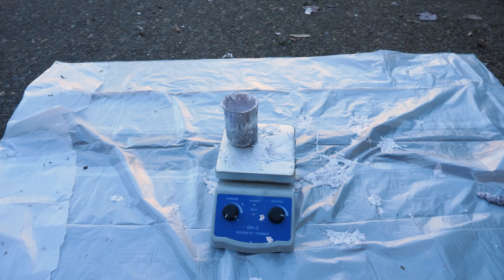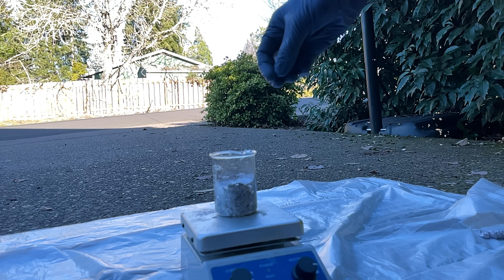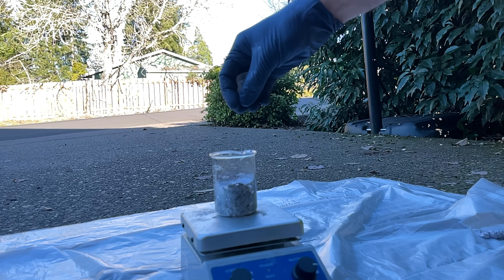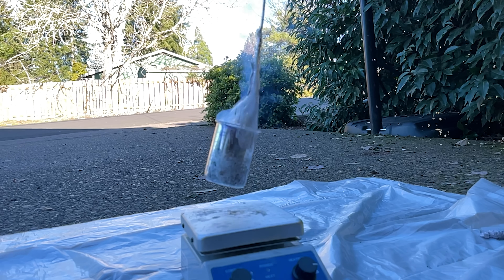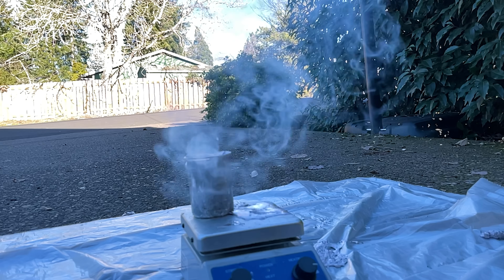Wow. It was completely unexpected how fast this actually reacted. The instant the ice hit the sodium, it reacted and exploded. And then a shower of molten sodium rained from the sky for a little bit afterwards.